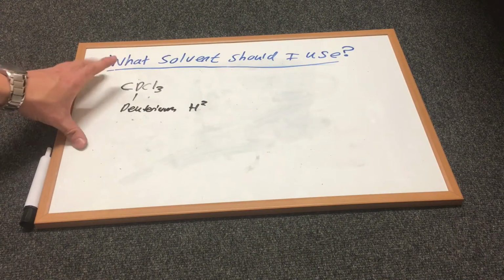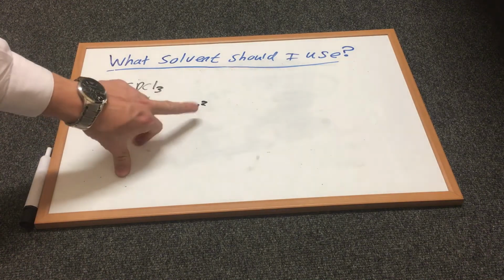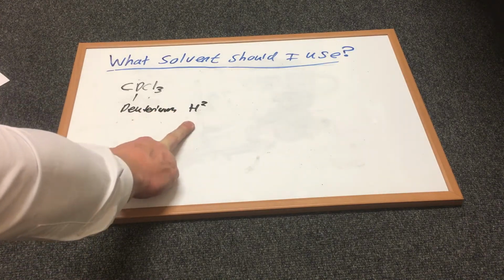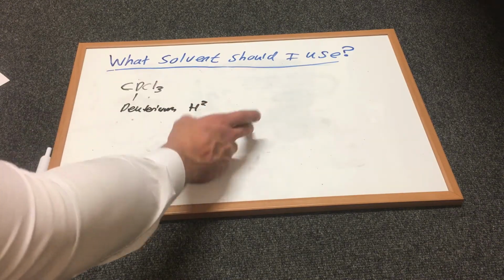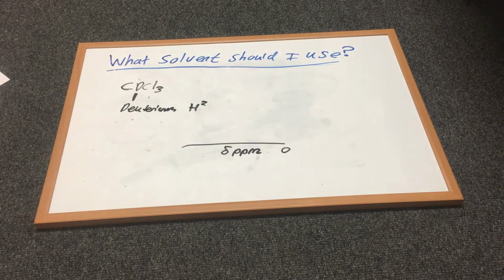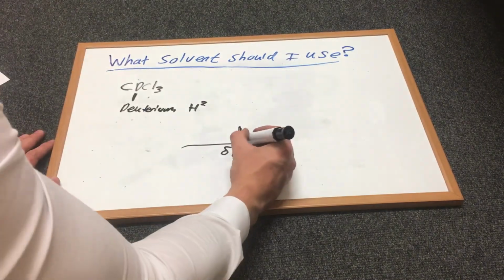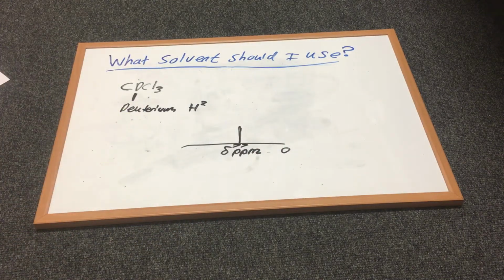The commonly used solvent is CDCl3. The D stands for deuterium, which is an isotope, H2, of hydrogen. So why is it used? H2 does not have a spin, so therefore no signal will be shown for this solvent on the spectra, so that will reduce confusion with other peaks. In rare scenarios, they may add the peak on, so be careful, watch out for a peak at 77 parts per million, because that's often CDCl3 solvent.